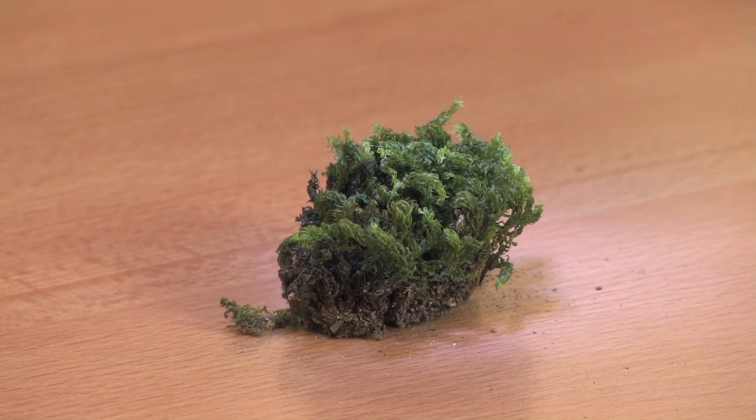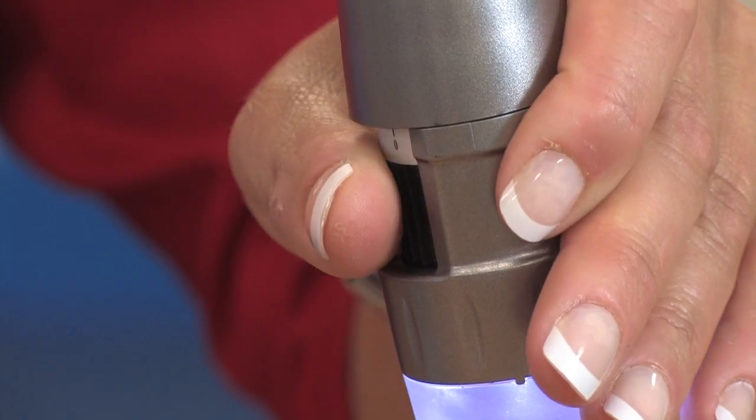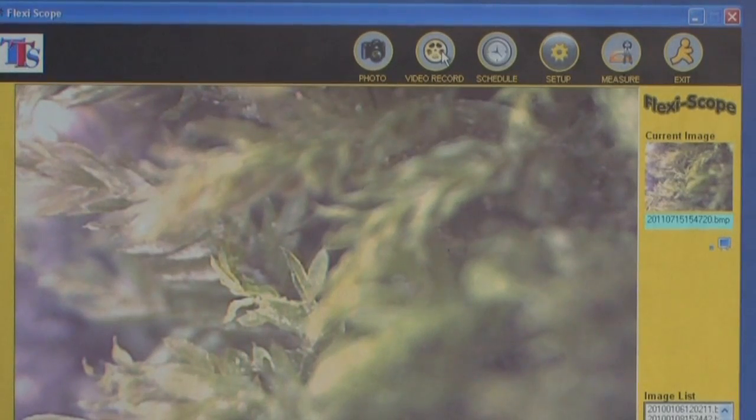To get started, place the object under the microscope and twist the wheel to focus from times 10 to times 200 magnification. To take a picture, just press the camera button. To take a video, click the video icon to start and stop recording.